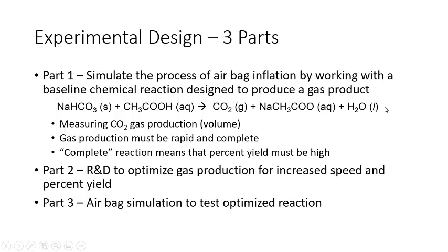So this is just a simulation of the reaction. The true airbag reaction includes sodium azide to produce nitrogen gas, which is a much faster and more rapid reaction. But we're going to use this just as a mimic reaction where we're producing a gas in a chemical equation. So in part 1, we're going to be getting used to working with our apparatus.